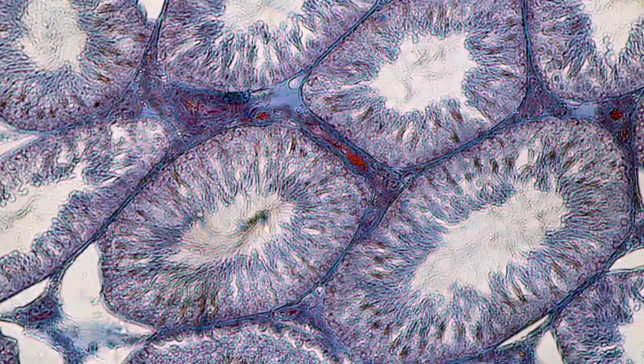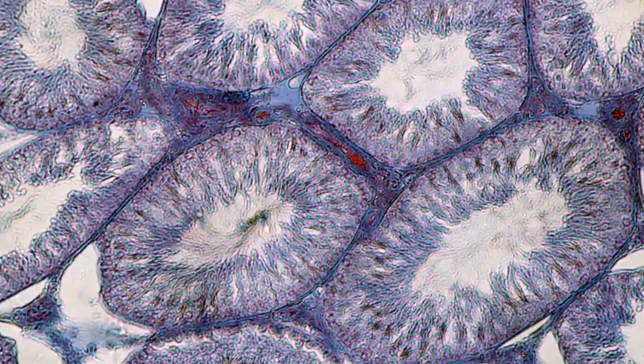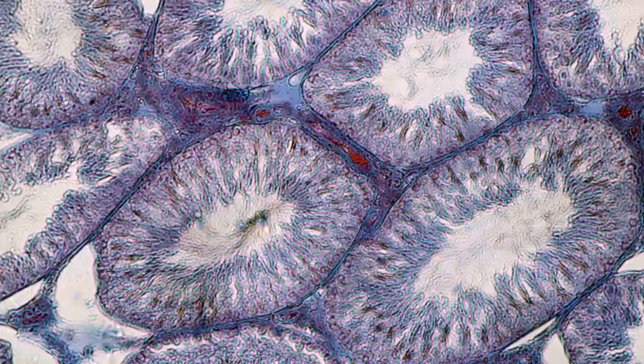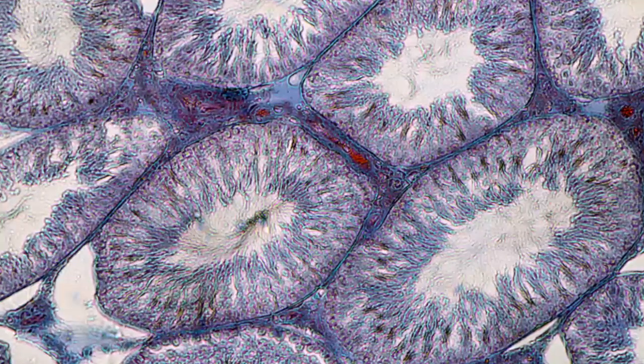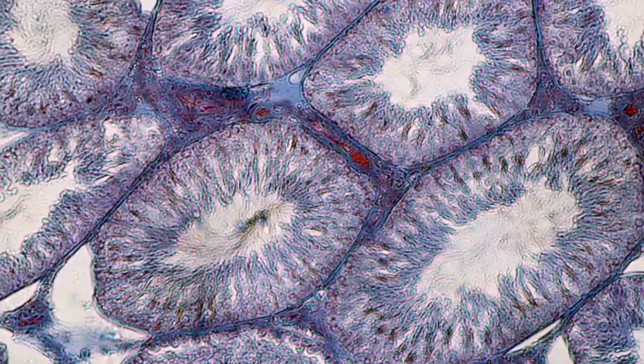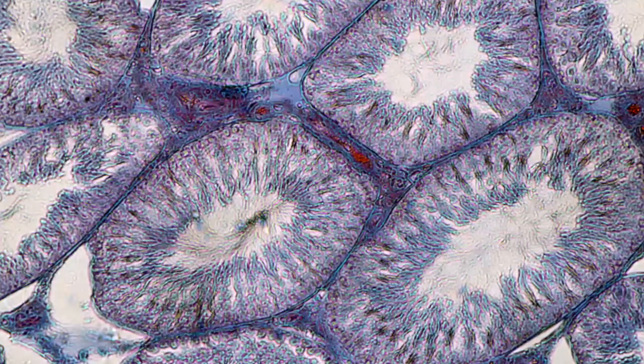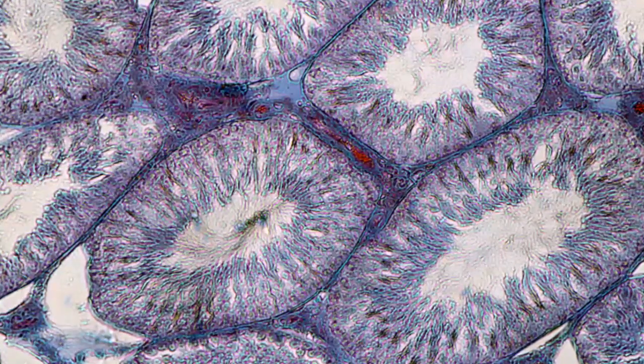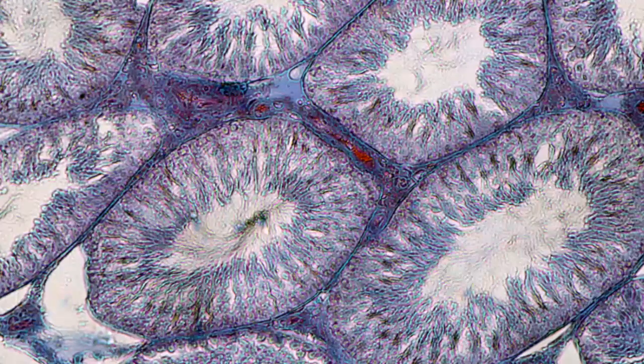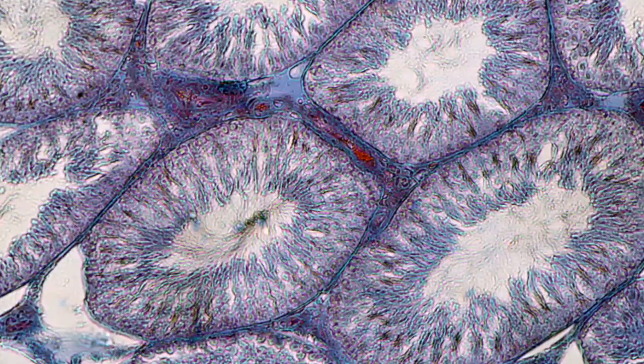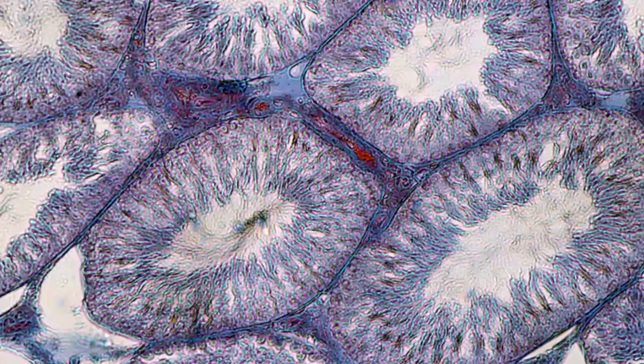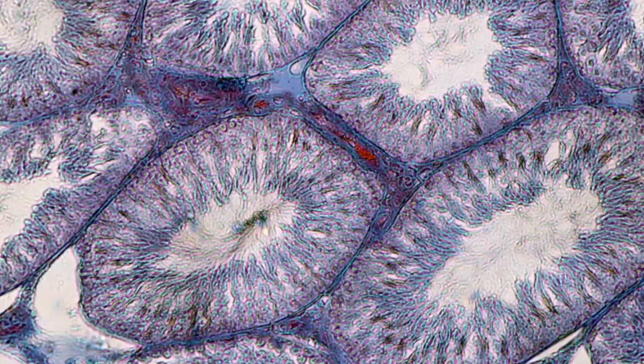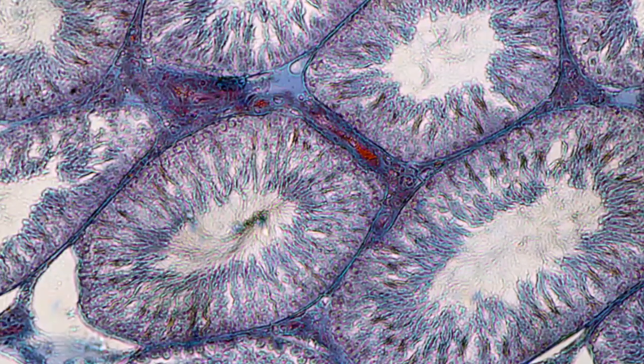Now this last slide looks a little bit strange. You might see that there are lots of lines there, and it's a little bit blurry. I just wanted to show this to you. This is an example when you do not use proper microscopy technique. In this case, the condenser of the microscope was closed too much. And all of those lines that you see are so-called diffraction patterns. So what you have to do is you have to open the condenser a little bit to improve the resolution and the image quality. I just wanted to show this picture to you so that you can compare how the image quality can change when you open and close the condenser of the microscope.